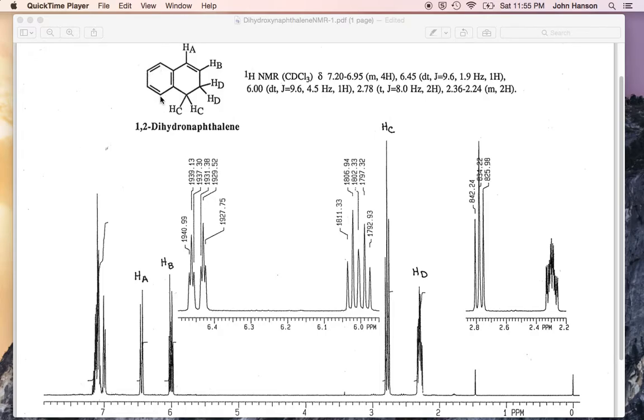Where do the aromatic protons come? Do you remember? Well, from our little cheat sheet, we usually say they come from about 6.5 up to about 8.5. And if there's no electron withdrawing or electron donating groups, just alkyl groups on it, they're typically right around 7 to 7.5. And so you see right here, this integral is going to integrate to 4 protons relative to this one right here. And so there's our 4 aromatic protons right where we expect them.